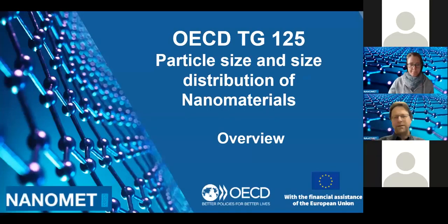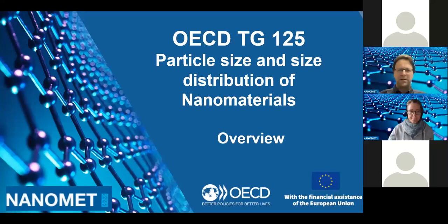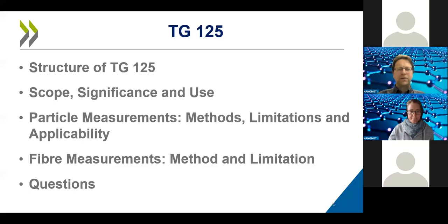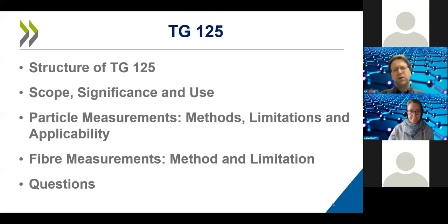Thanks, and welcome to this section. I'll give an overview of what to expect today. First, a short introduction to the structure of TG 125, then I'll go into detail on scope, significance, and use. There will be a large section on particle measurements presented by Harald Bresch, followed by a section on fiber measurements that I will present. We'll close with a Q&A period.